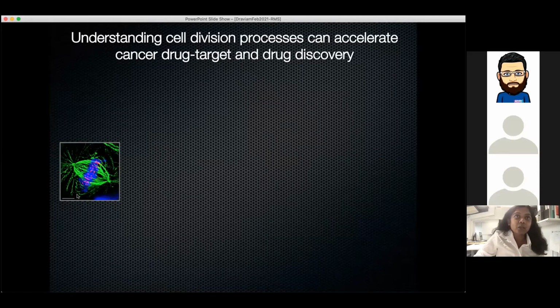It's capturing these chromosomes at a very small spot, a platform. I mean, in here it's a spot, but it's a platform made up of over 100 different proteins coming together to assemble a platform called the kinetochore. So in this image, what you are seeing there are those red spots.